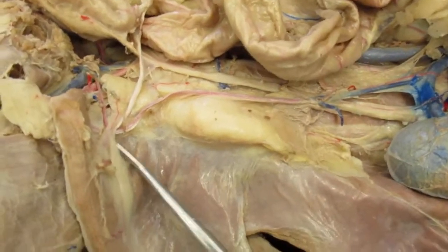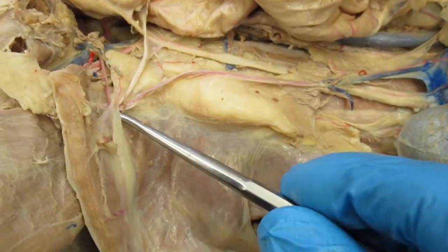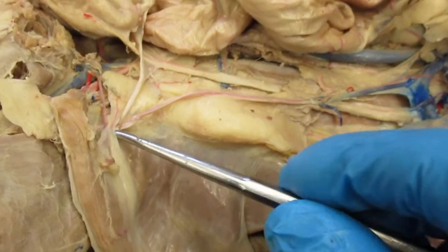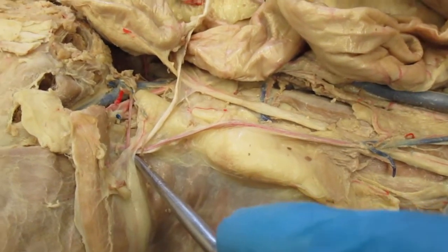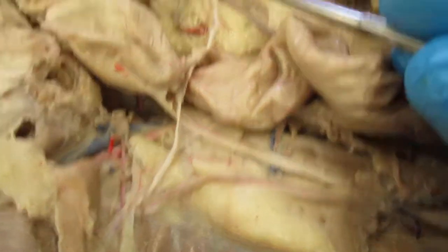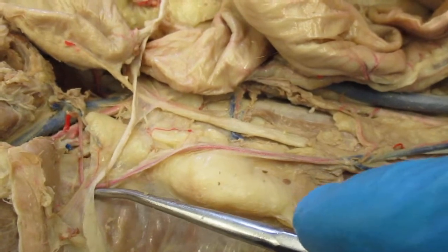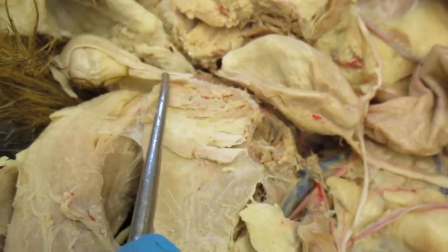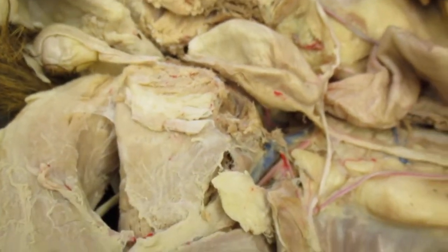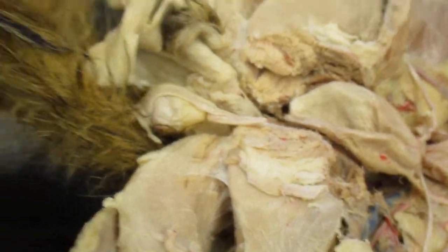Now the testicular artery and vein are going down into this canal here called the inguinal canal. This is the inguinal canal where the probe is at. Inguinal canal. Here and here. And then you can see the spermatic cord right here, which houses the vas deferens and the testicular artery and vein.